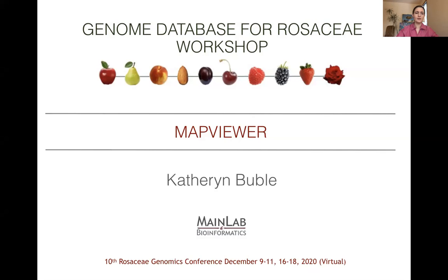In this presentation, I would like to show you how to use MapViewer to view and compare genetic maps in the GDR website, introduce you to several of its features, and show you upcoming functionality.